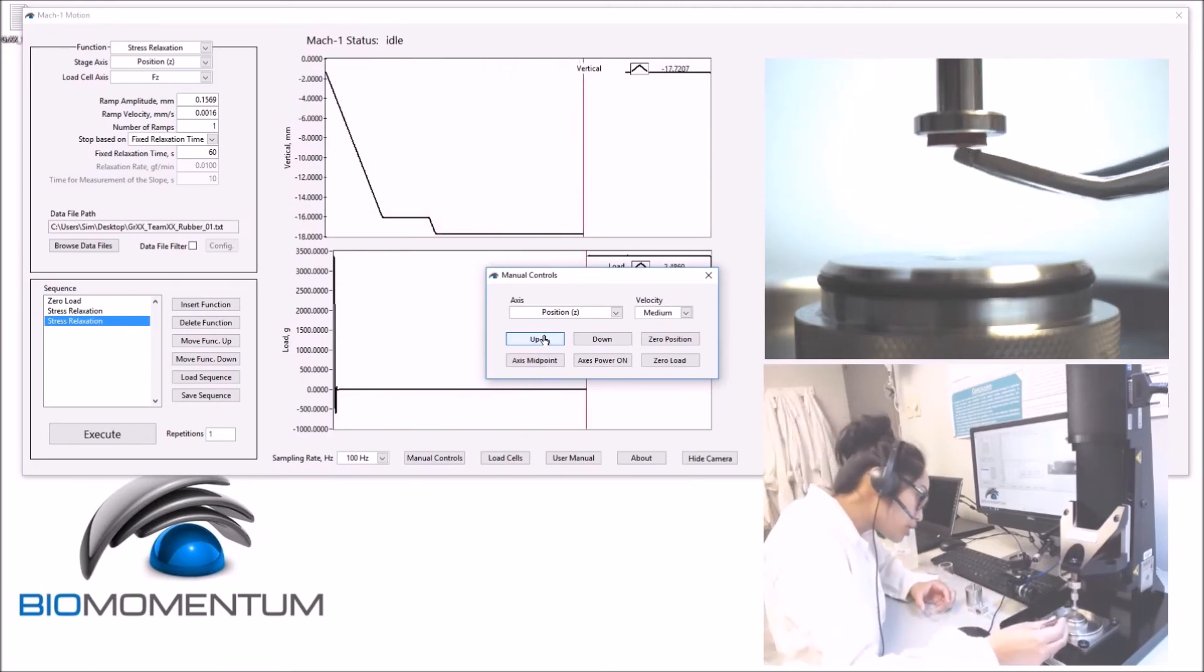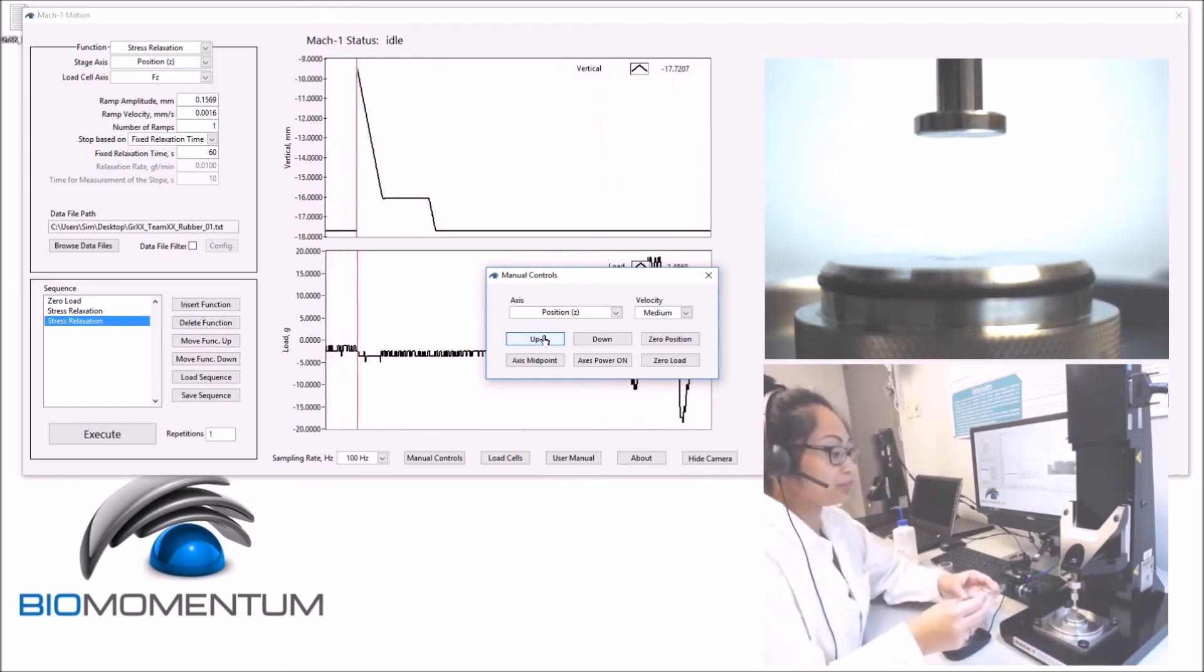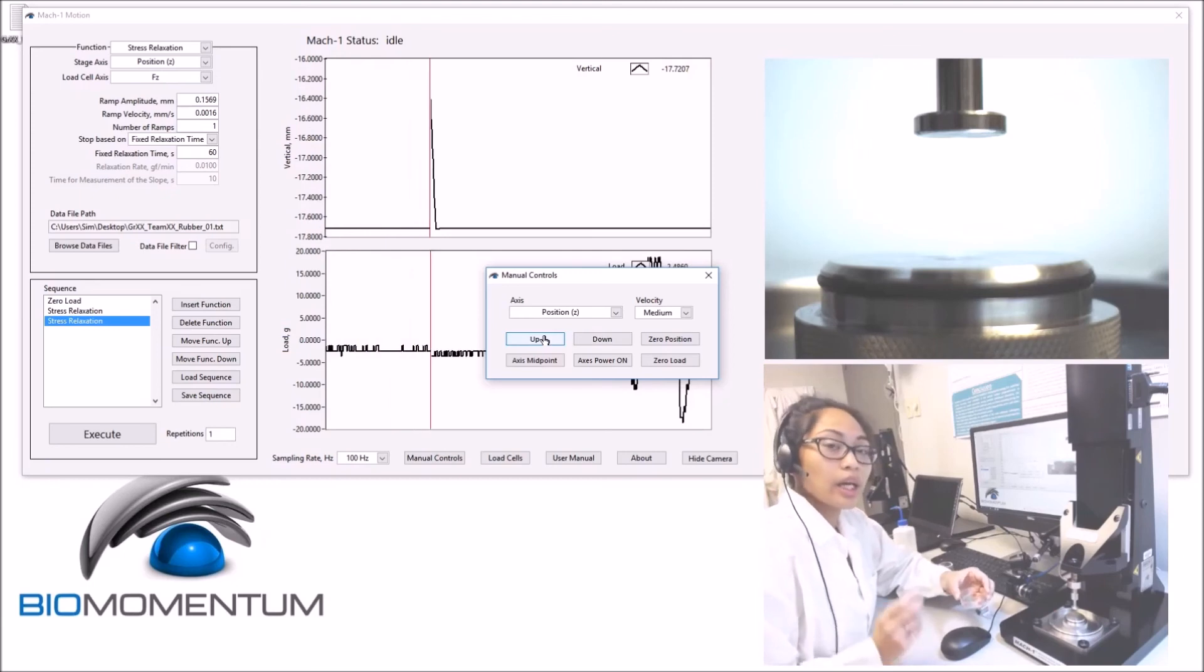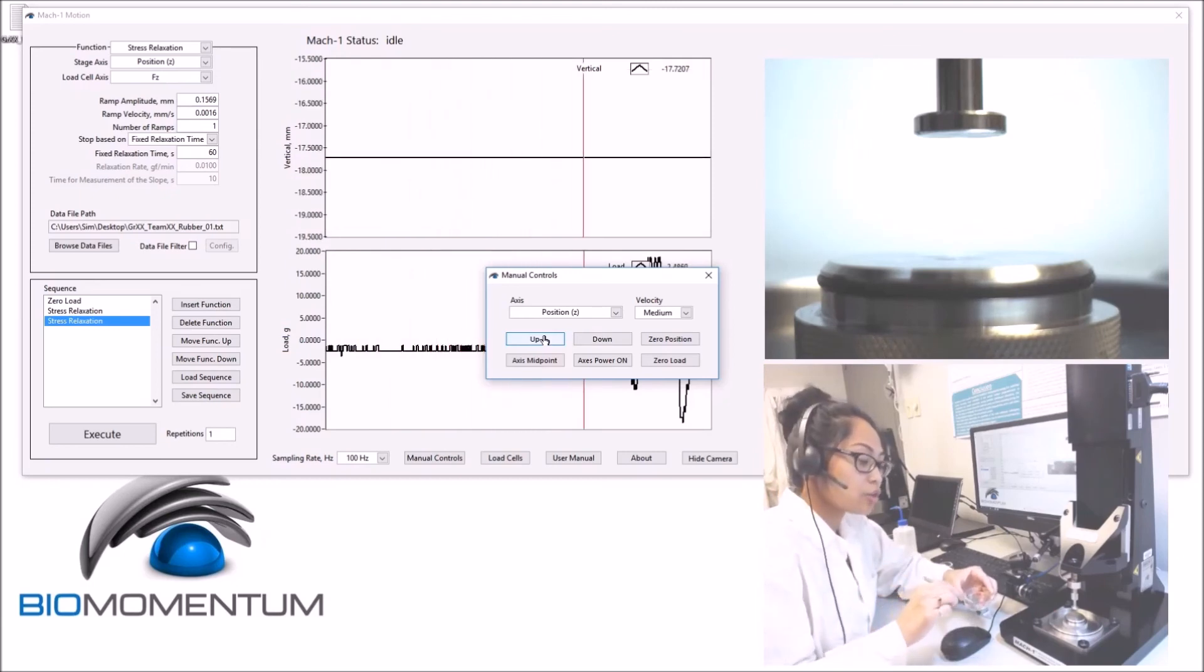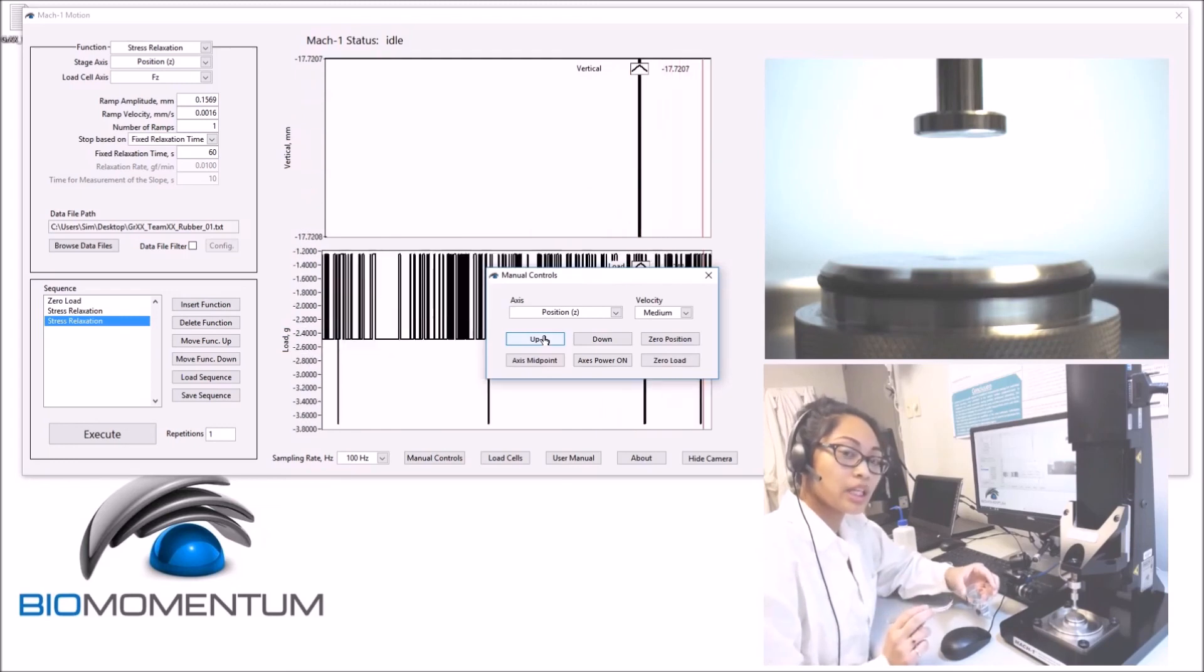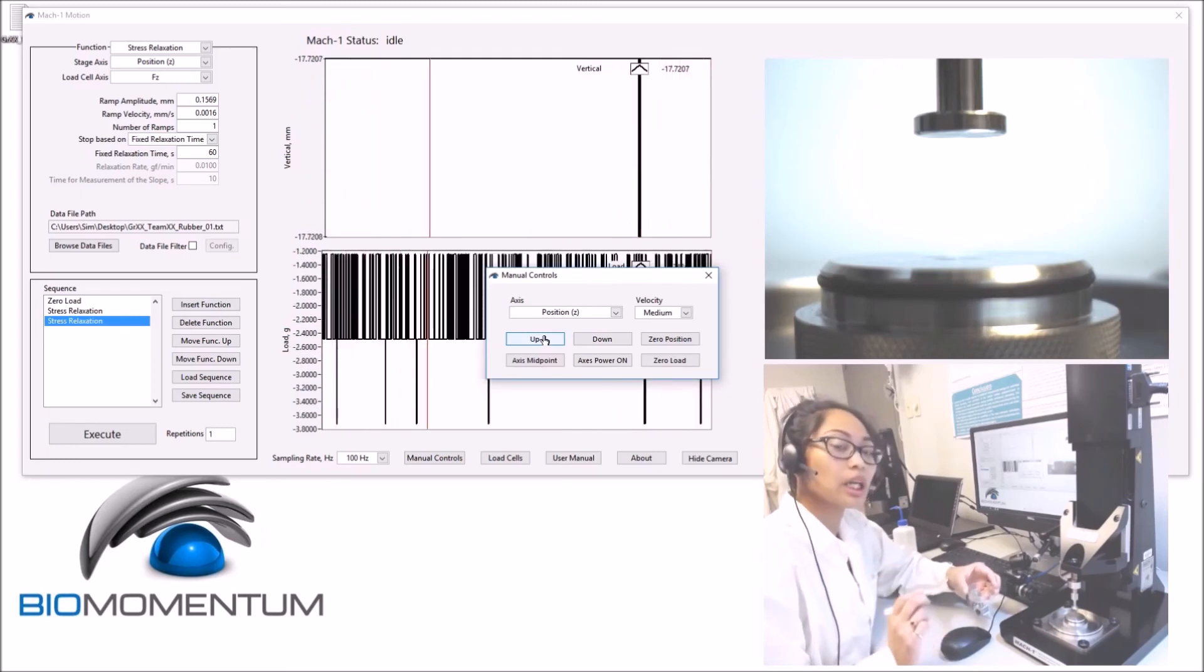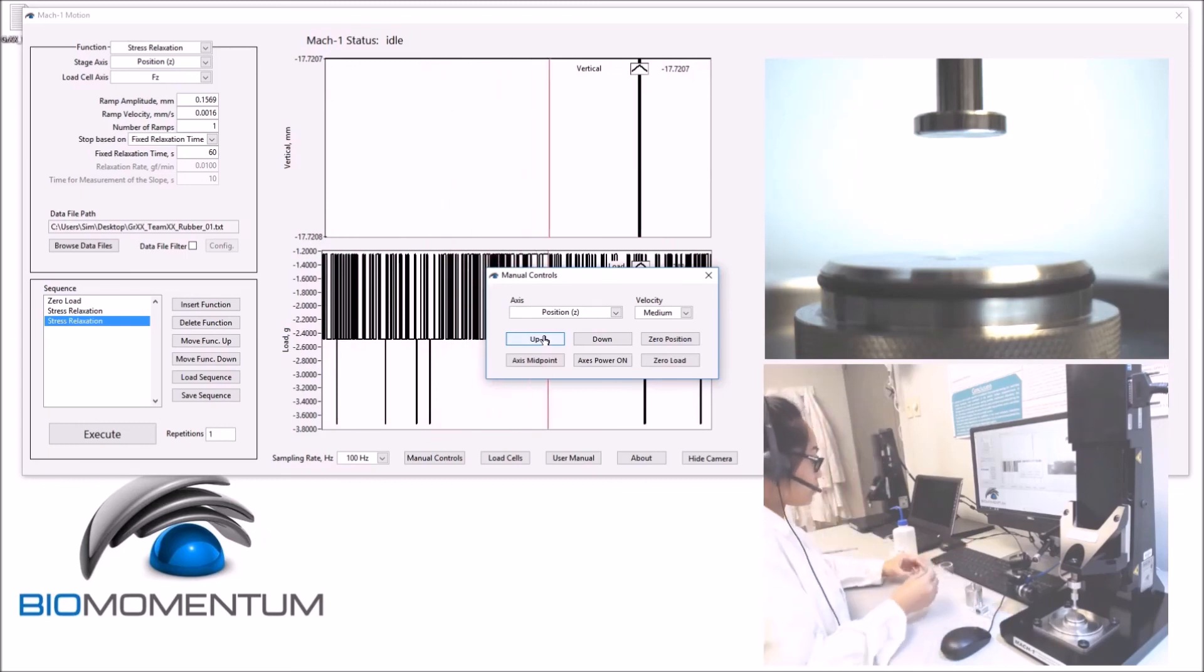Remove the sample, and repeat the same steps, starting from sample thickness for the two remaining rubber discs, with the strain rate being 5% and 20% respectively. Thank you.